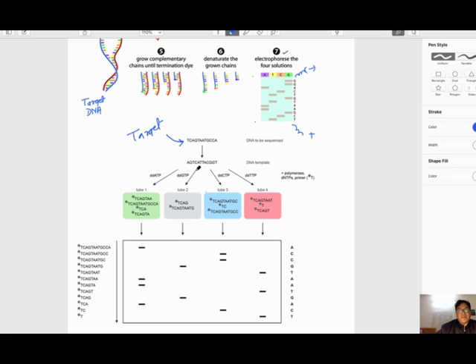Say for example, in the second test tube we take dideoxy GTP, and then only 2 fragments are formed, and likewise for dideoxy CTP and dideoxy TTP. There will be different fragments. These fragments are then separated through gel electrophoresis, and from lower to upper, this is the minus terminal and this is the plus terminal of the electrophoresis. We just have to label from below, from the smallest particle to the largest particle. These bands are labeled.